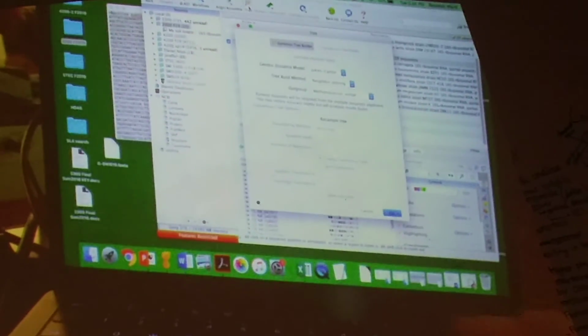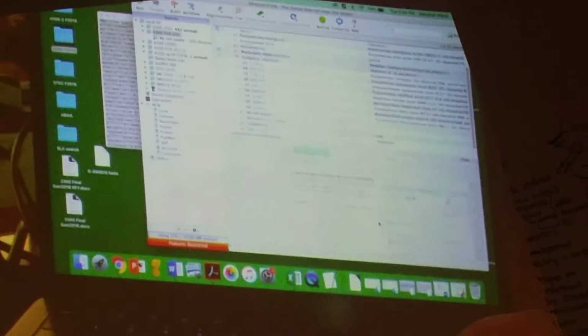Which folder was it selected in? I put them in my original folder where the tree background and my isolate are. You hit Control V, or I just drag and drop.